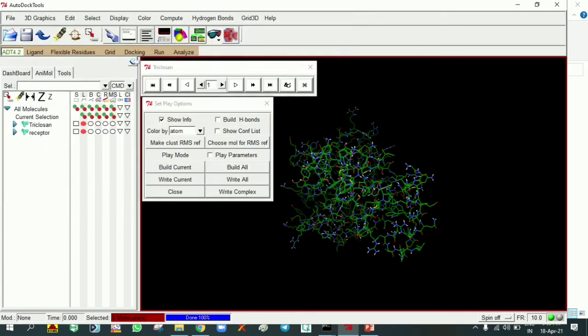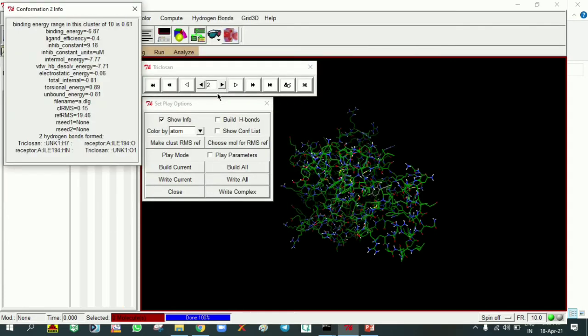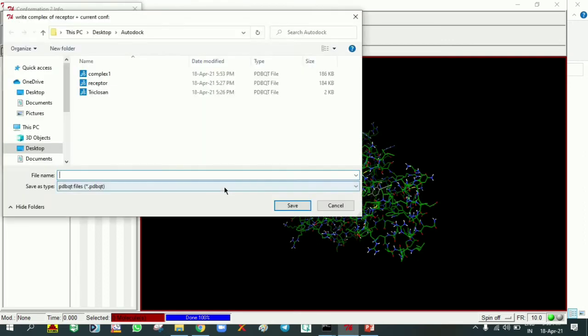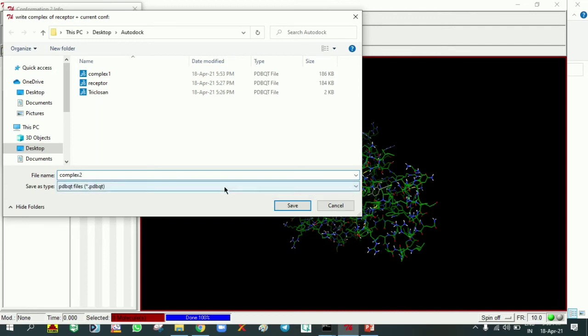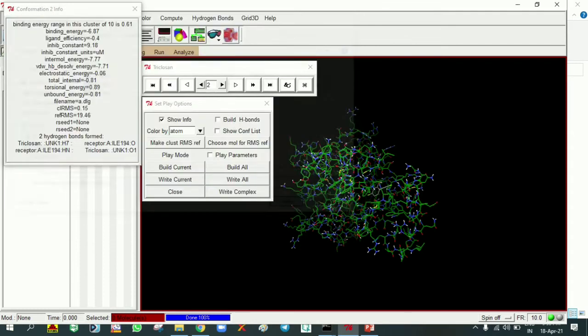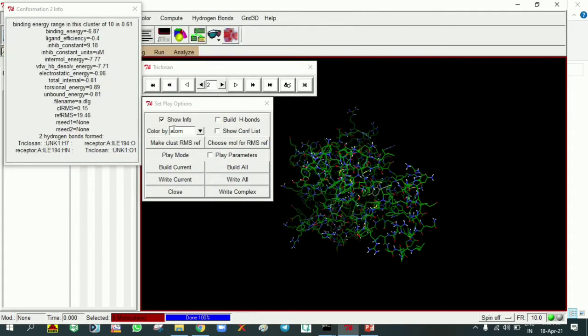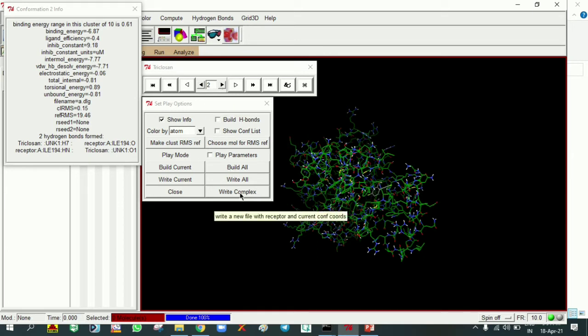Similarly, going to the second conformation, it is minus 6.87 with inhibitory constant 9.18 micromolar. Same, write complex. I'm making it as complex 2, that is conformation 2 of the result, PDBQT save. Remaining conformations are not making any hydrogen bond interactions. Only conformations 1 and 2 are making them, so only those two I saved as a complex along with ligand and protein.